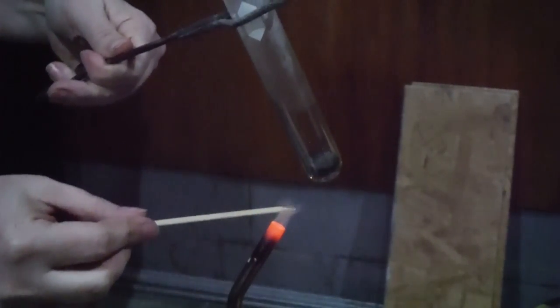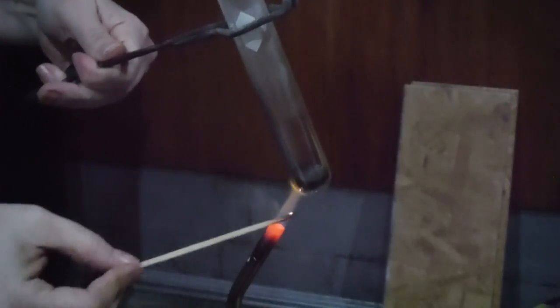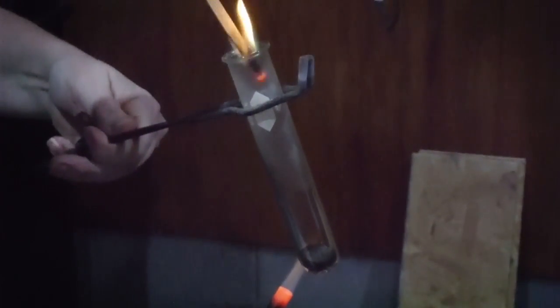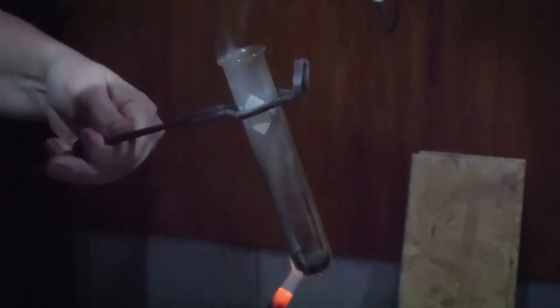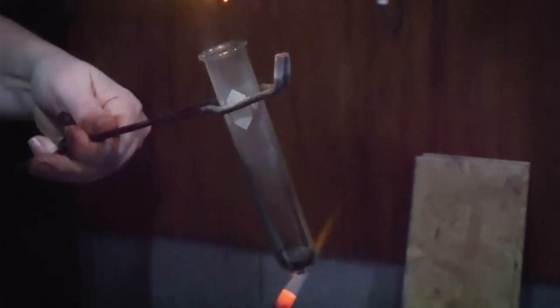So what you're going to see me do now, I'm going to bring in a wooden splint and light it and stick it down in the test tube. This is one of the observations you need to make. And then just after this video ends, you're going to see what the copper carbonate looks like when I dumped it out of the test tube and back into that dish.